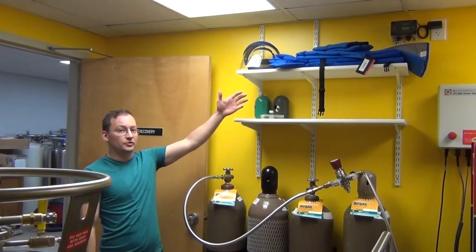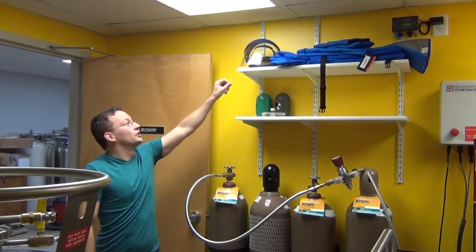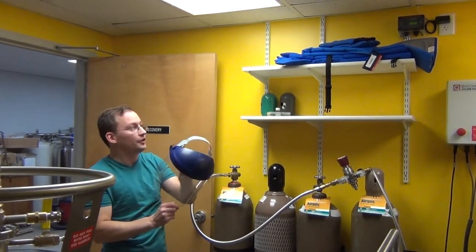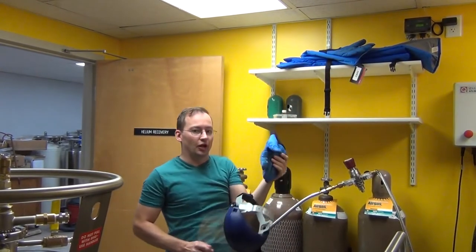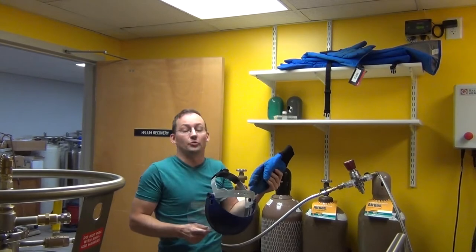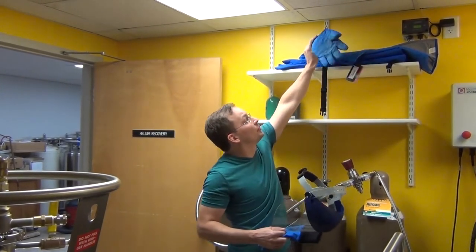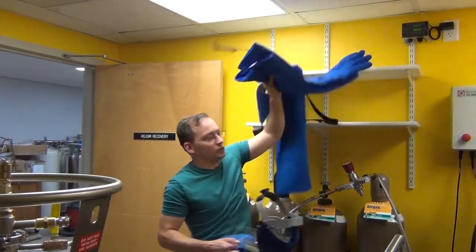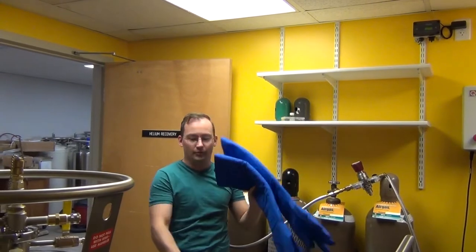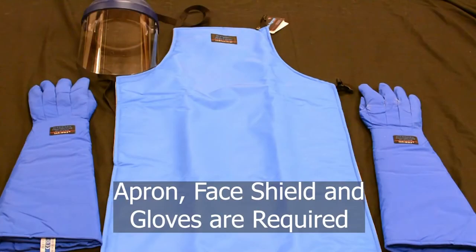Right as you come in the door, up to your left, you'll find all the safety equipment you'll need. You've got your face shield, and two sets of gloves — a short glove, which is fine if you're familiar with the process, and elbow-length gloves or even shoulder-length gloves if you're not familiar. We'll show you a still image of all this equipment laid out to show you each of the pieces.